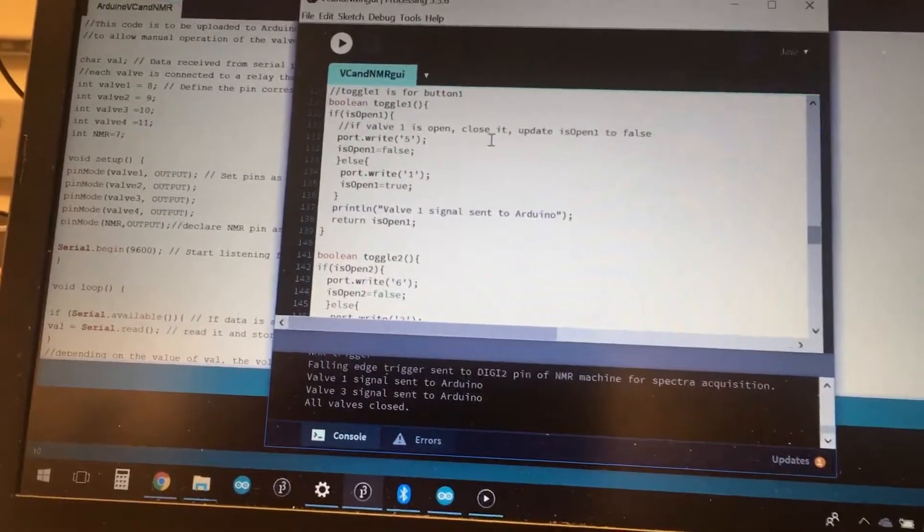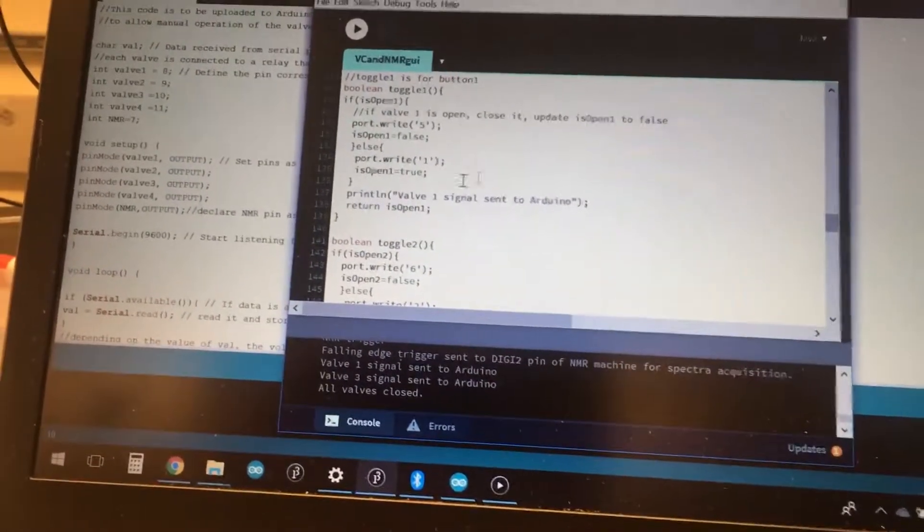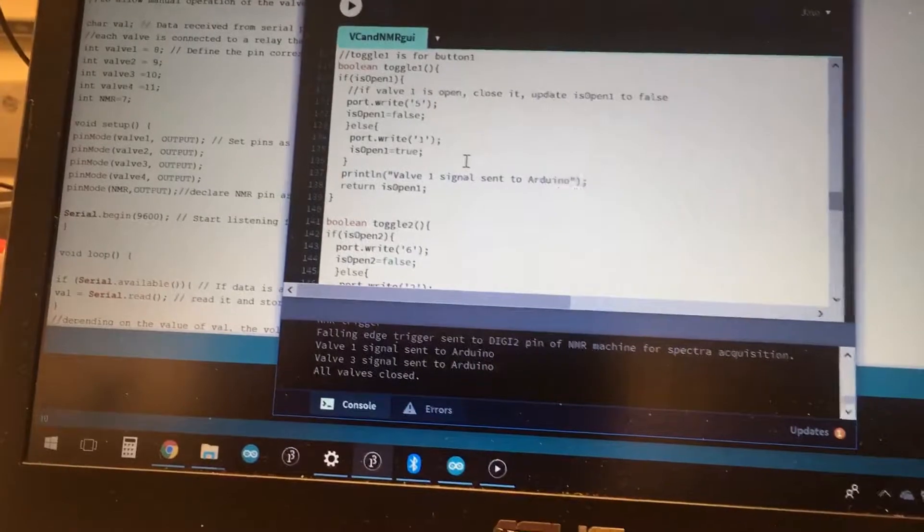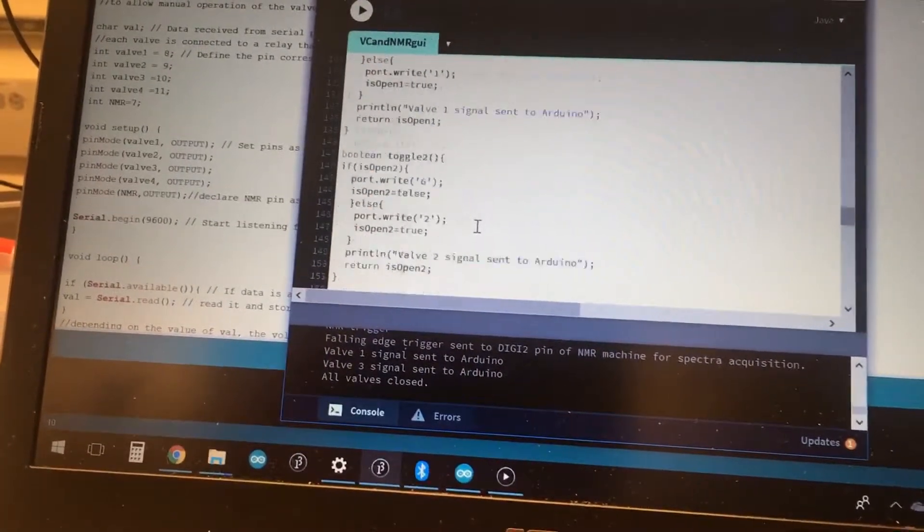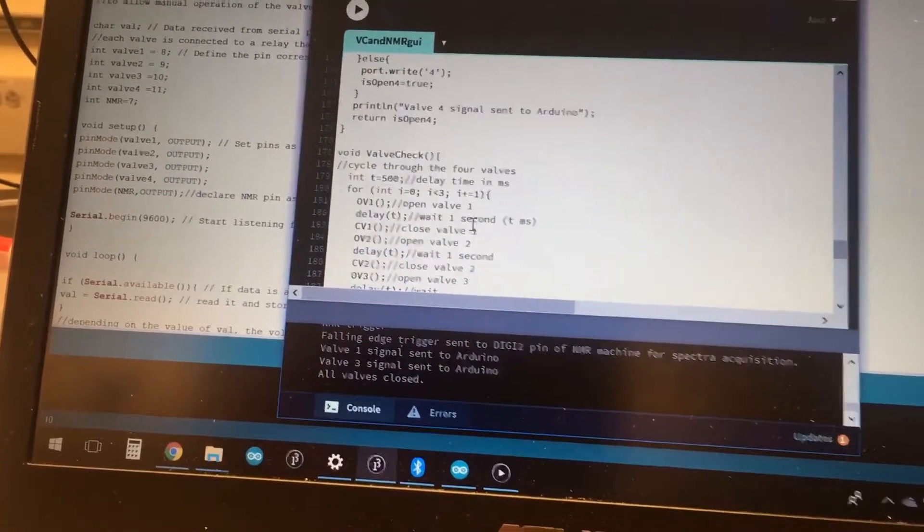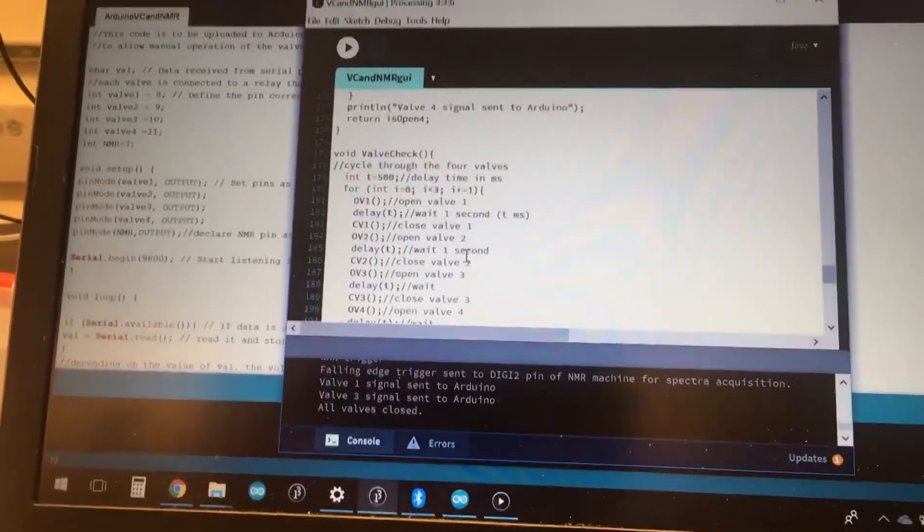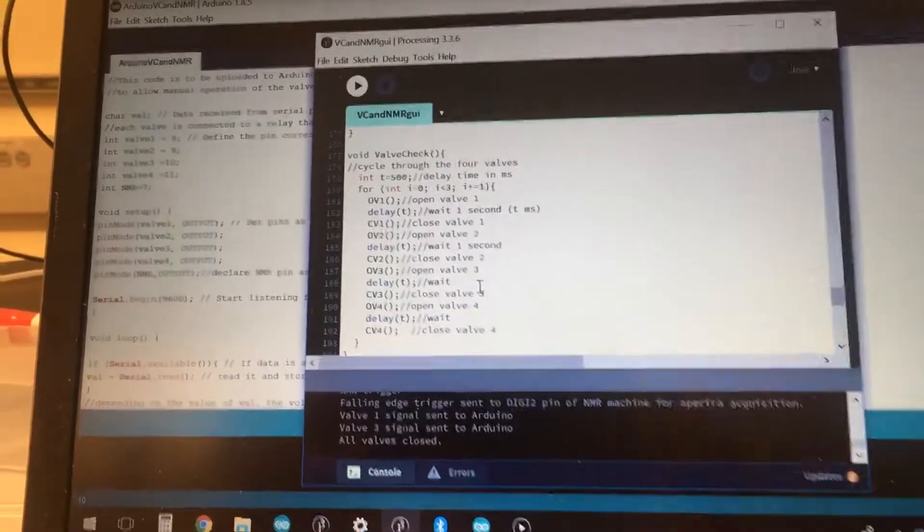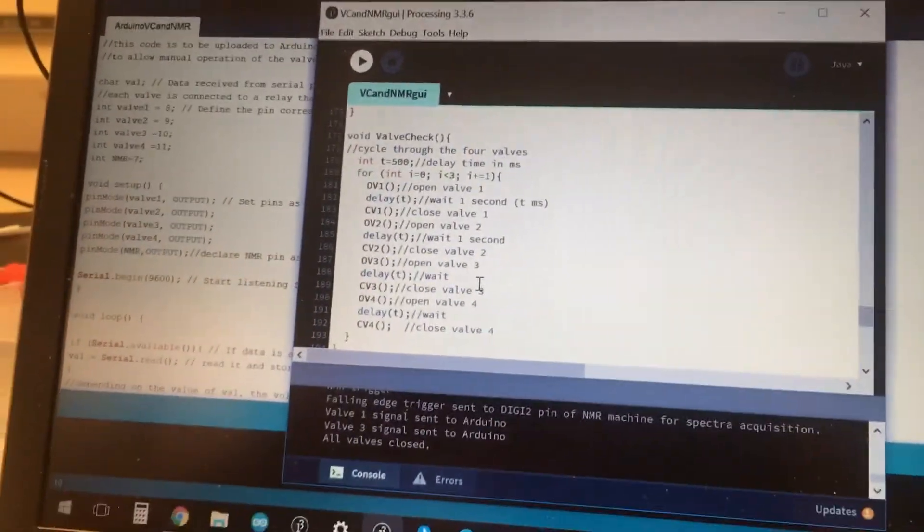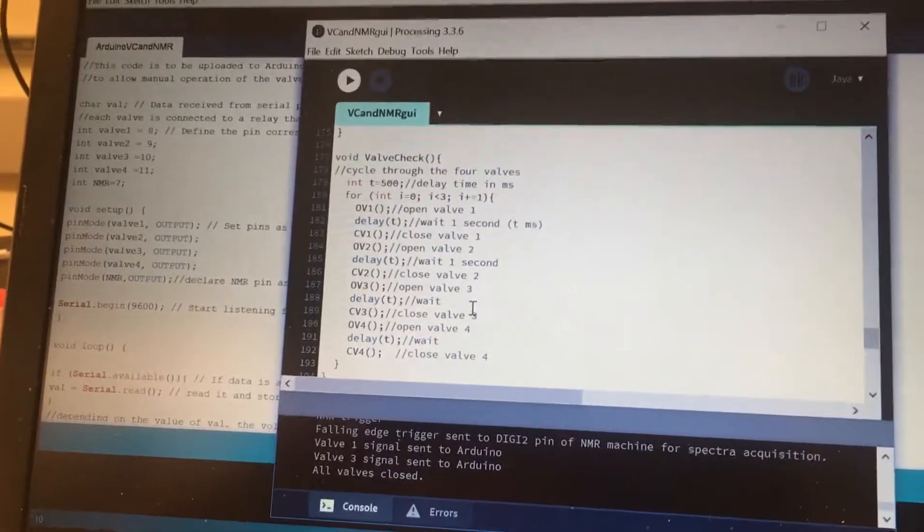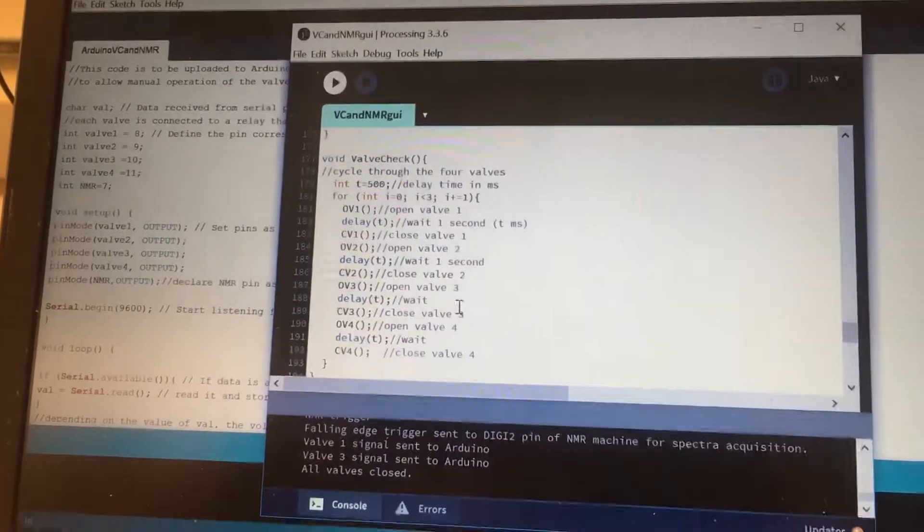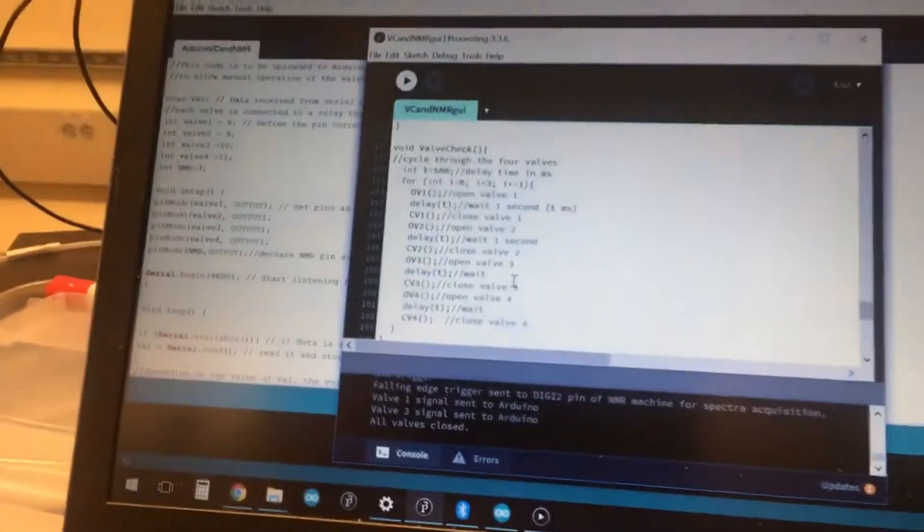We're using Booleans to check if the valves are open and closed before we do something. If we look at the valve check code, for instance, it's just a simple for loop that iterates opening and closing the four valves consecutively as a way to test in case we have electrical problems later on in our experiments.